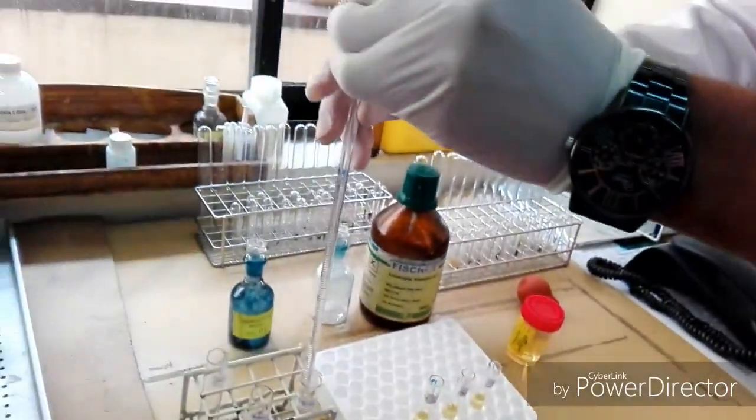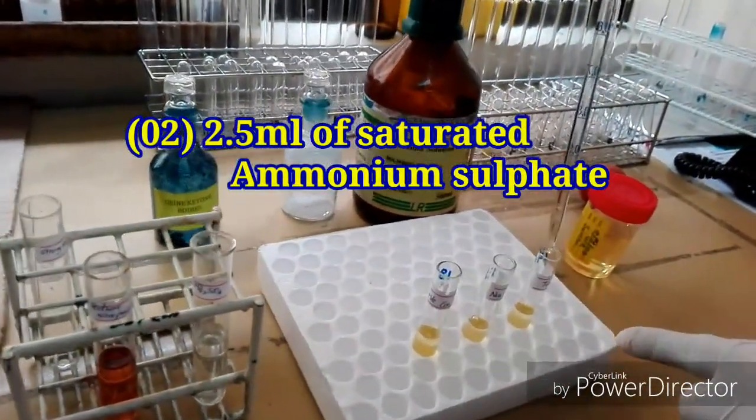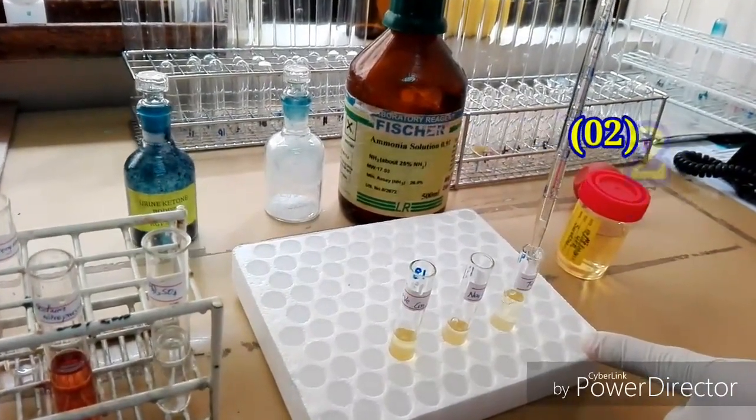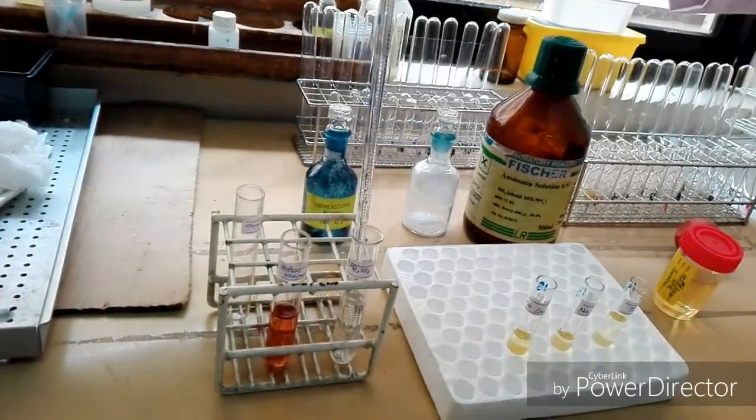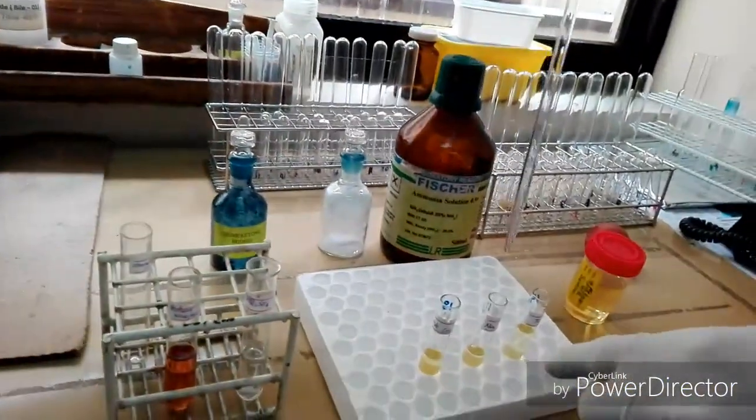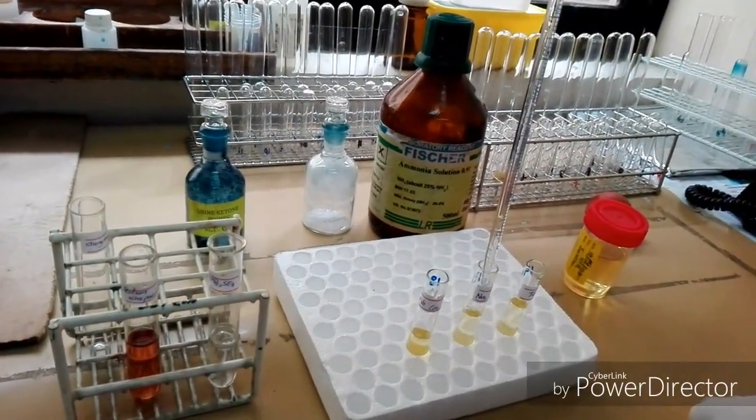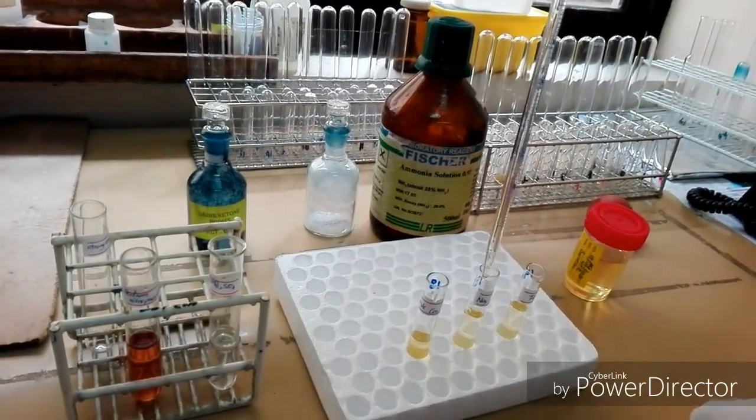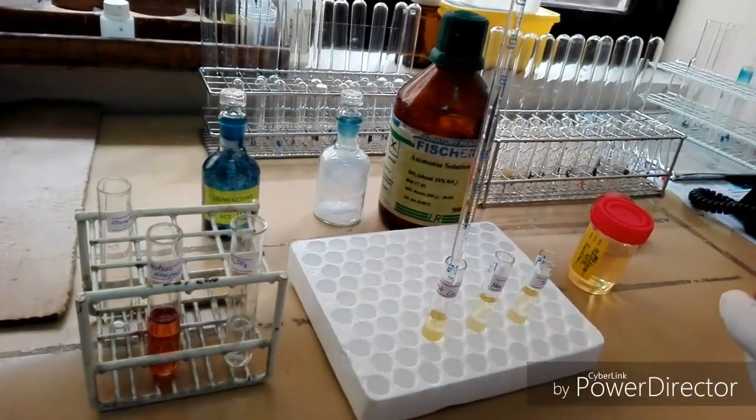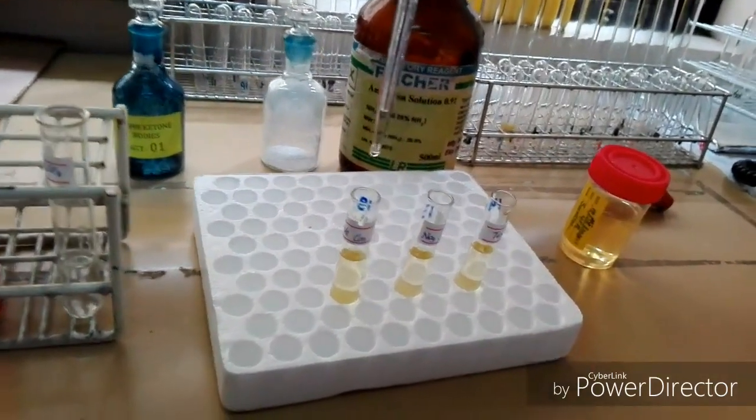Then we add 2.5 ml of saturated ammonium sulfate into each test tube. Now let's add 2.5 ml of saturated ammonium sulfate to the test, then to the negative control, and finally to the positive control. Okay, now we have added 2.5 ml of saturated ammonium sulfate into each labeled test tube.